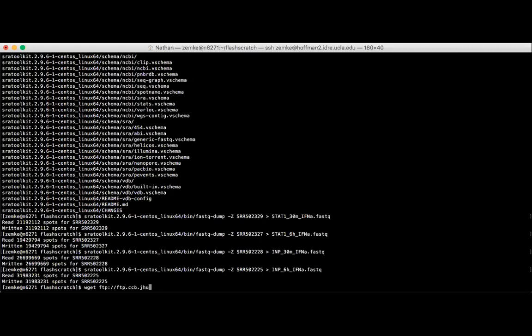If yours aren't done yet, don't worry. You can do the alignment at any point once they finish. I'm just going to go ahead because time is getting low. It's 3:45, so we still have 45 minutes. So we should be done before then. But if you still need to do the alignment, you should have time.